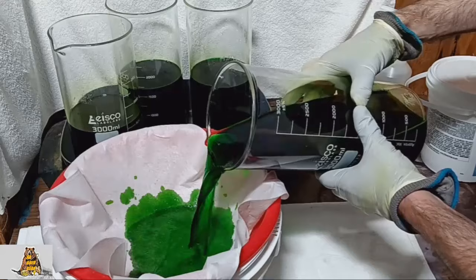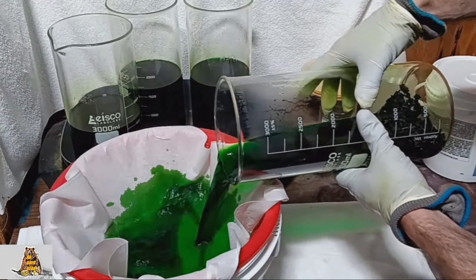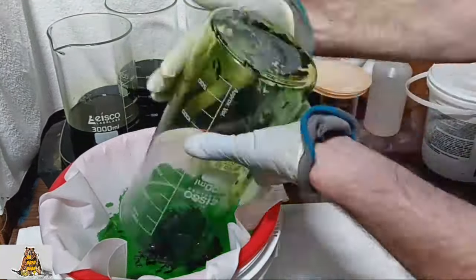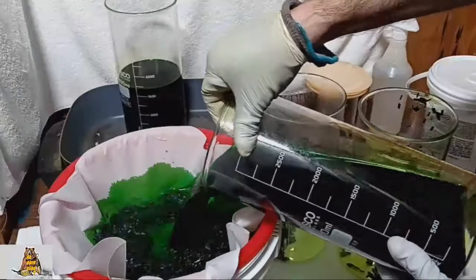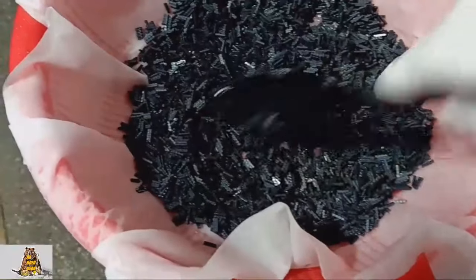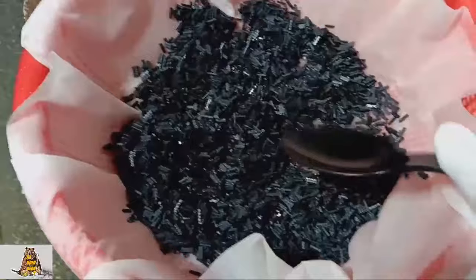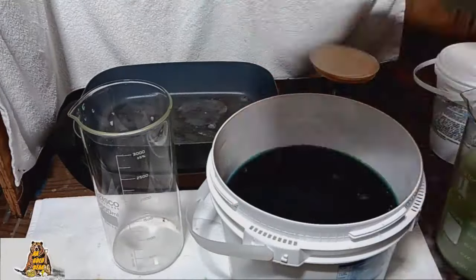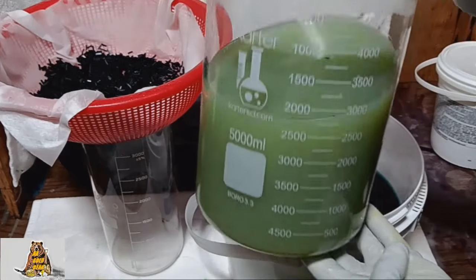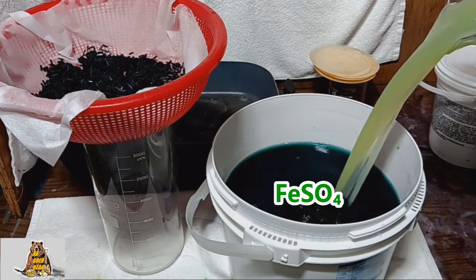There is a lot of copper in the solution — copper with gold. Now all the metals are dissolved. In my experience, the best way to precipitate gold from a dirty solution is with ferrous sulfate. I dissolved 1000 grams of ferrous sulfate in water.